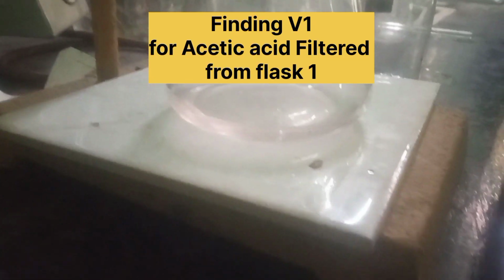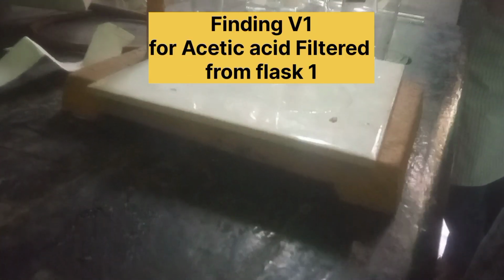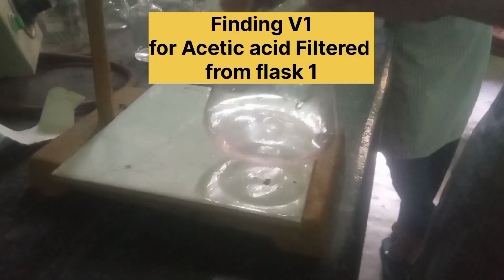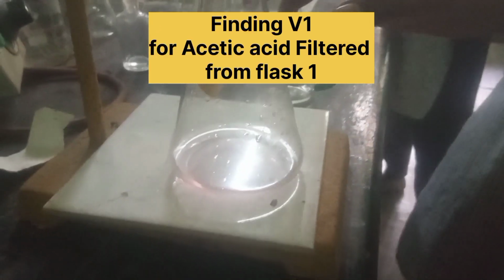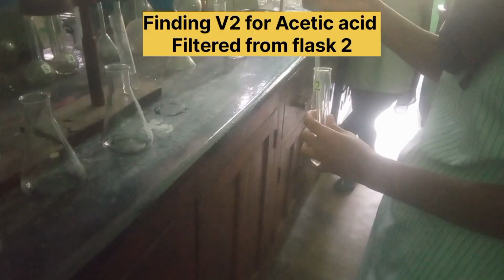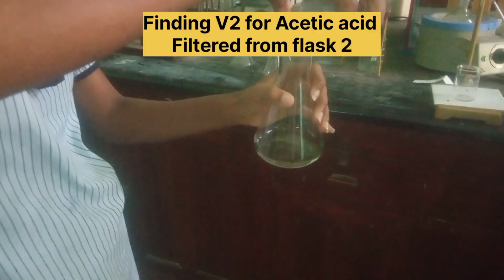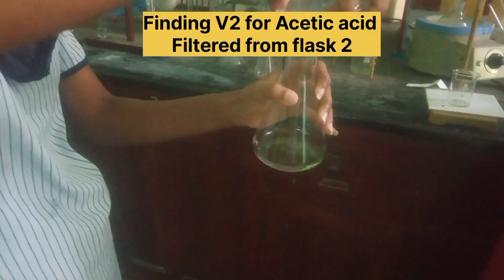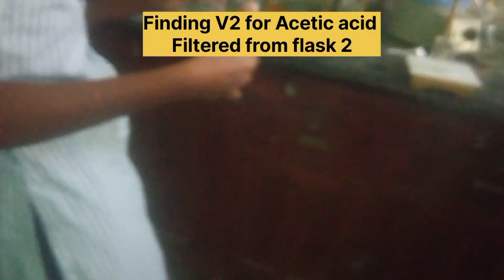After that, one has to titrate the acetic acid solution filtered into boiling test tubes from standard flasks 2, 3, 4, 5 to get the corresponding volumes of NaOH required to neutralize the acetic acid collected from the respective standard flasks.